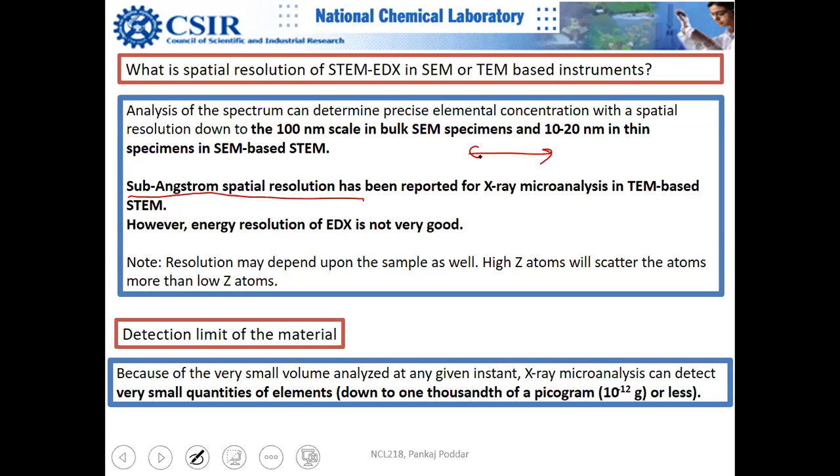Because you see the data is collected from the depth also, right? So sampling area, whatever I'm telling you. Spatial resolution is always lateral, but you are collecting the data from the depth also. I think we discussed last time, but it's not depth sensitive. I want to clarify it. But it collects the data from a certain depth. So you have to be careful there. And EDAX is notorious there because you are using photons.